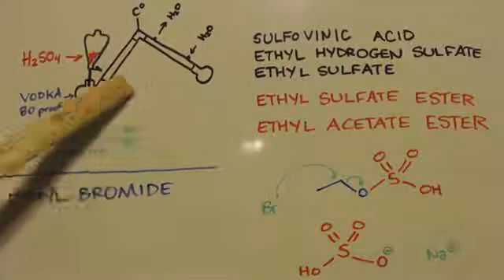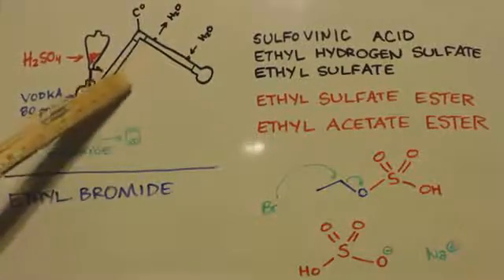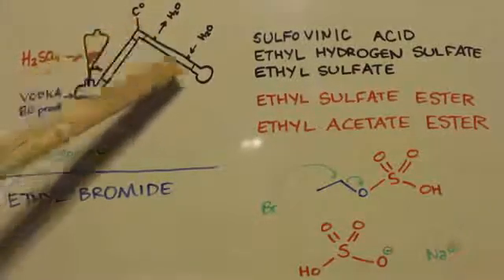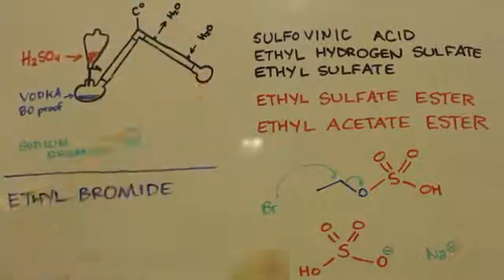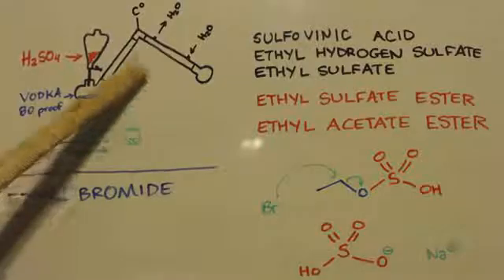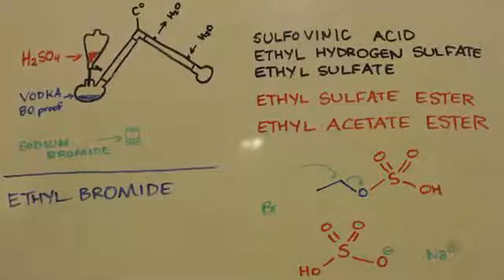Basically, you can see I got it set up for distillation already. A bigger Vigrex column, thermometer, my condenser, water in, water out, and my receiving flask. And I'm just going to boil everything out. That's basically it.